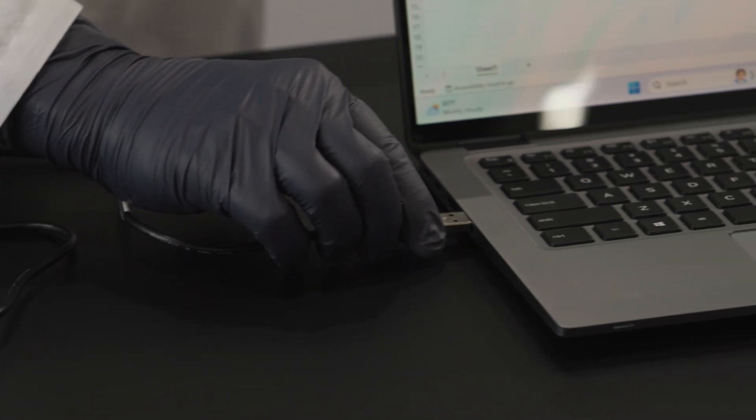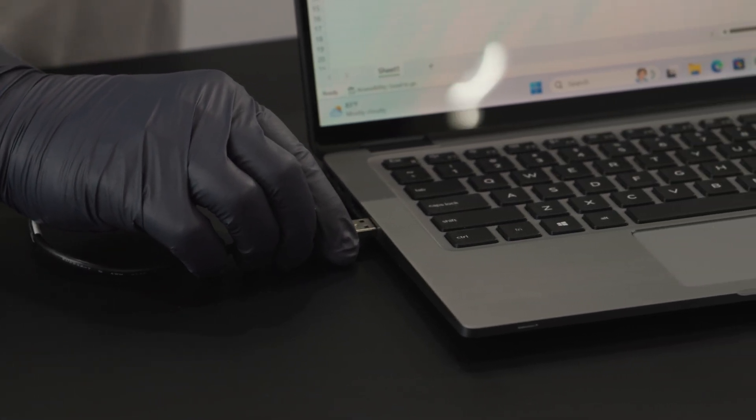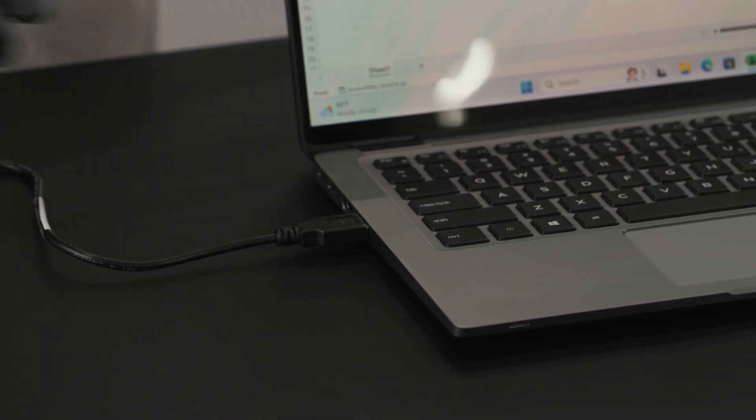For data transfer, look for an easy-to-manage solution such as USB connectivity. USB connectivity is convenient and universally compatible, offers plug-and-play functionality, and facilitates fast data transfer.